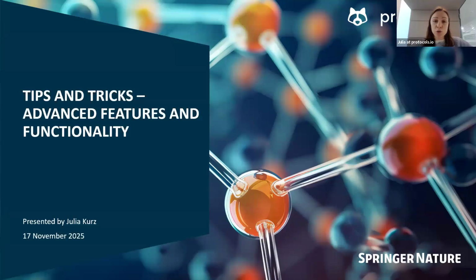If you are very new to protocols.io and don't really know what it's about yet, I would recommend starting with one of our more introductory webinars. You can still stay, but just know that we will be skipping over some of the more basic introduction and how to use protocols.io.